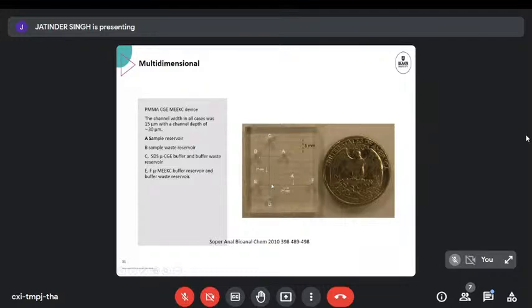Then whatever comes on the injection cross here, by activating the voltage here, we can do SDS. We can do MEKC. So we've got gel electrophoresis happening in this dimension. We can collect the sample, inject it here again, and do an MEKC, an affinity distribution between the micelle separation, down in our second dimension. So a single chip for multi-dimensional separation.